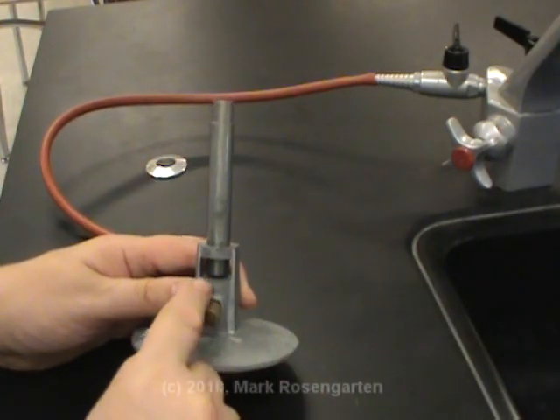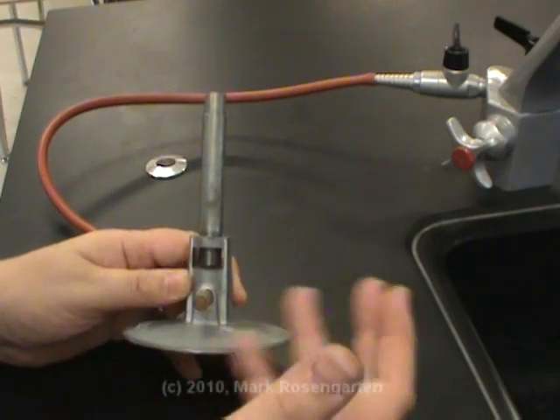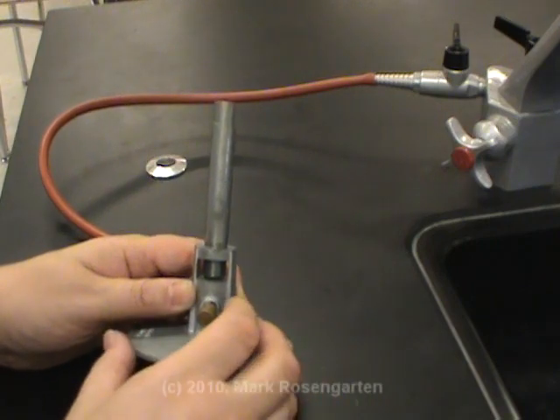When you first light the Bunsen burner, you want to make sure you have an air hole but not one that's too big, because gas and air burn together. If you have too much air and not enough gas, you're not going to really get a flame. You're going to get a whoosh.